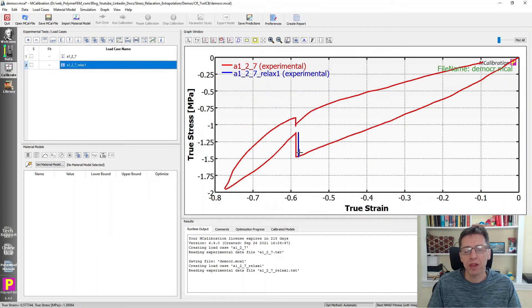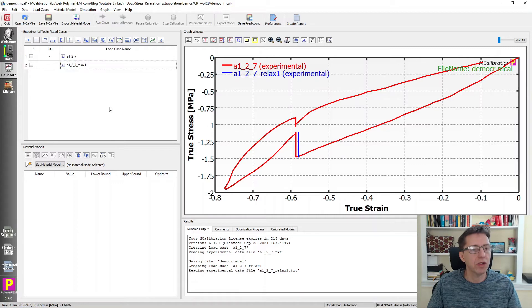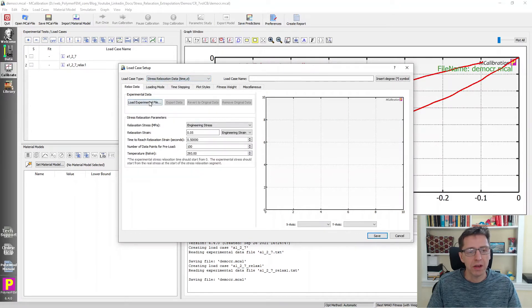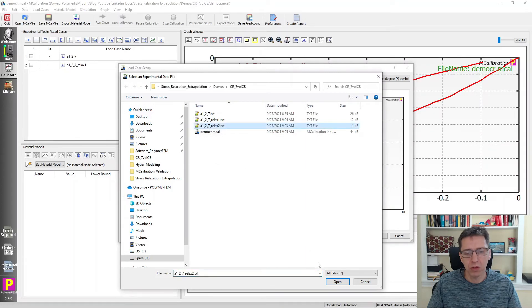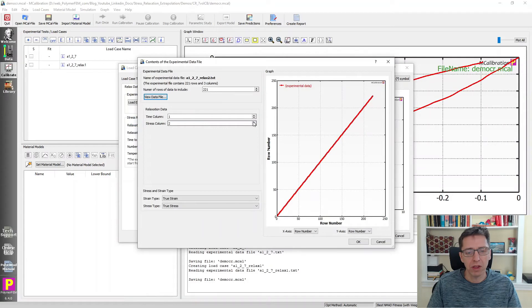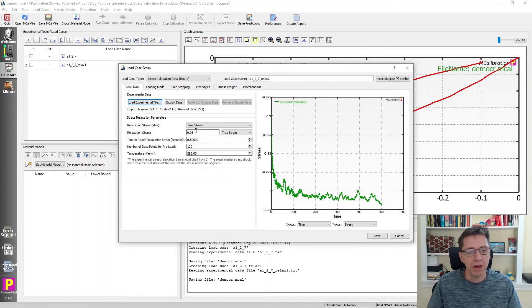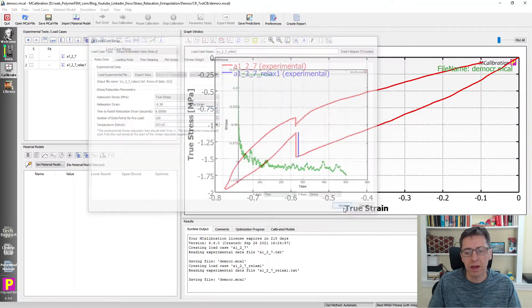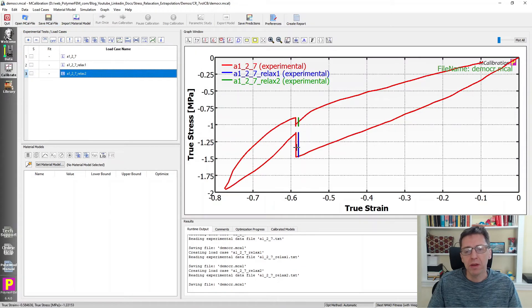Now we can see it plotted — it only has this relaxation portion; we removed all the stress-strain data before and after the relaxation. I'm going to read in the second relaxation segment as well: stress relaxation, select relax2, stress column is three, and the relaxation strain is 0.58. It took about six seconds to load. Here it is — I save this one. Now we have these two relaxation segments in blue and green, plus the whole data set.